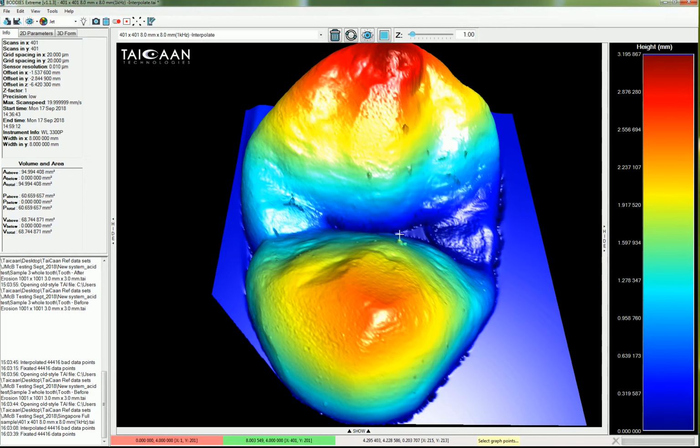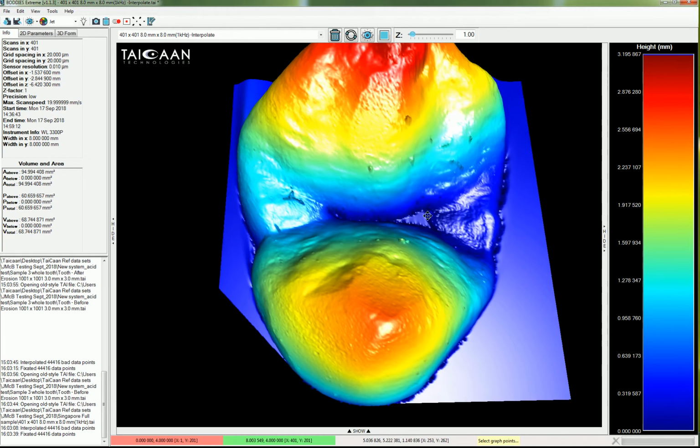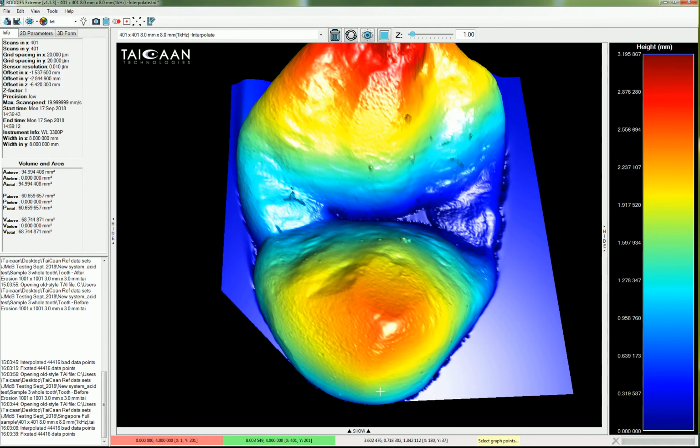We would always present raw data and then let the user use BEX, the software tool we're demonstrating here, to manipulate the data should you want to improve the image in some way. Right, so we're interested in this region, the slower region, where you can see a feature like a three-sided pyramid, with the white light reflecting from the high point here, and some pretty steep sides on this.